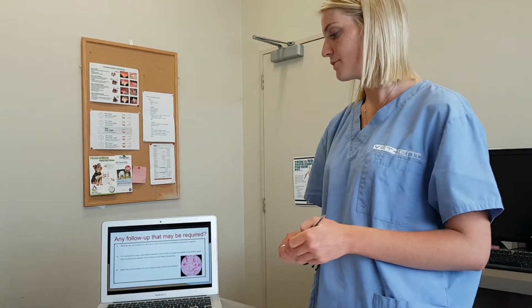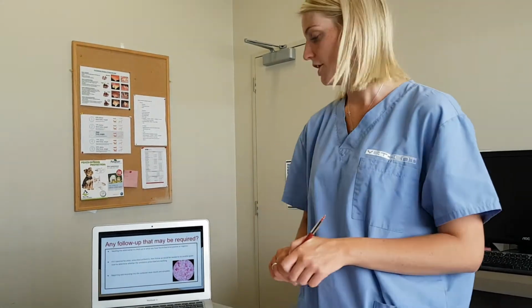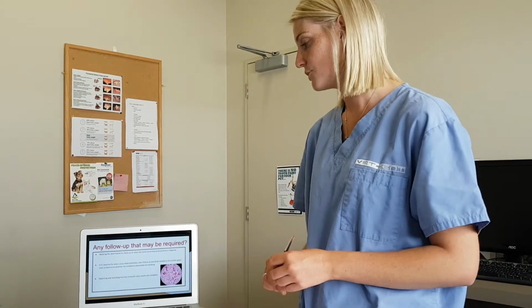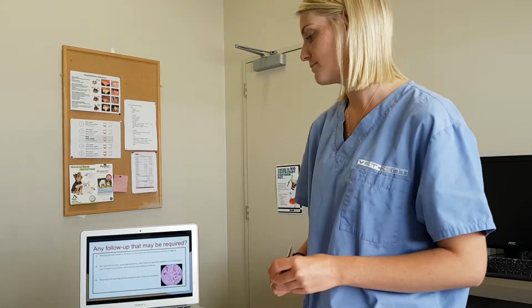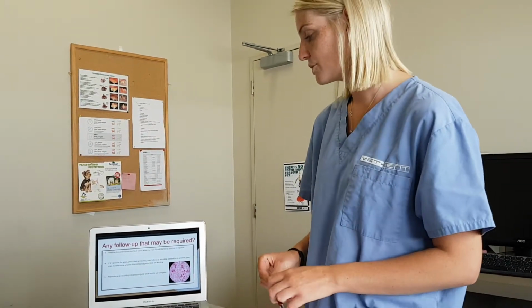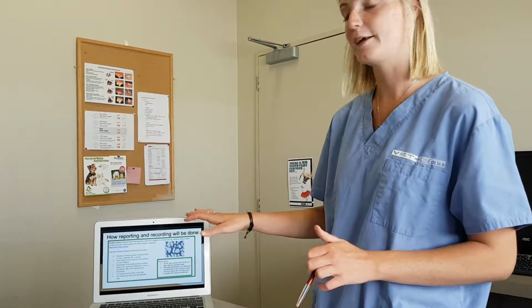So any follow-up that may be required, just a couple of bullet points. We'd need the vet to check up on what we have found on the slides, whether it be positive or negative, and then from there the vet will have to prescribe the antibiotic that they think would be good for this patient. So if it's positive for yeast, prescribe antibiotics, then follow-up would be needed to do another gram stain to determine whether the antibiotic prescribed is actually working. And then reporting and recording into the computer once results are complete, which I've just put a wee bit here.